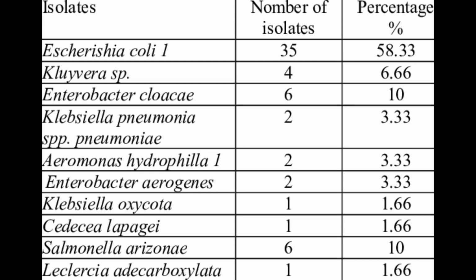Because it can deaminate lysine and produce alpha keto carboxylic acid, which is responsible for the red color of the slant. Their negative is purple slant. So we have three possible LIA reactions, the first of which is purple over purple.